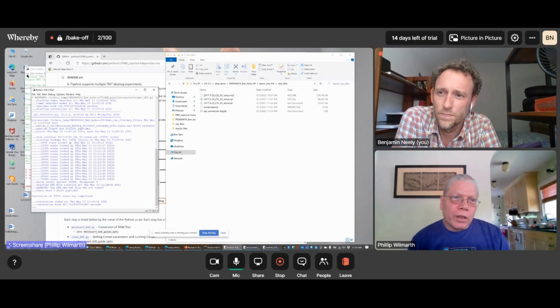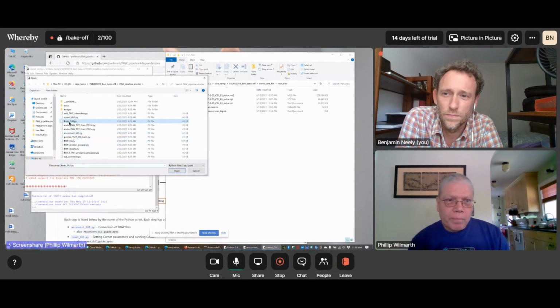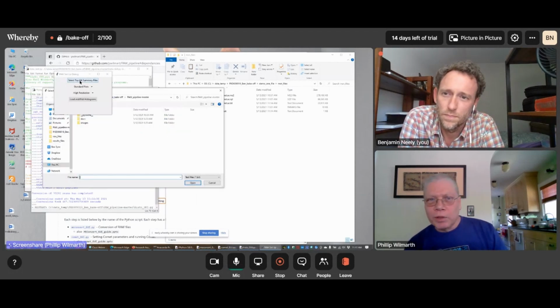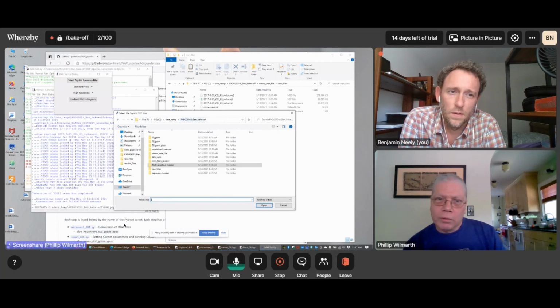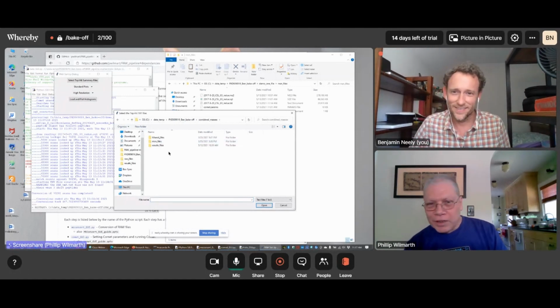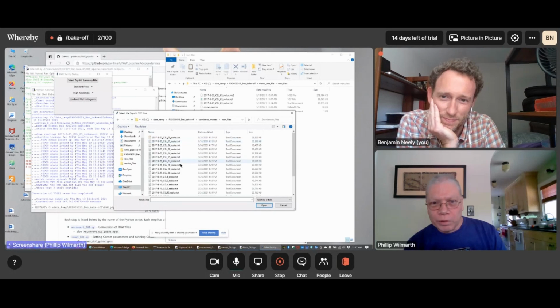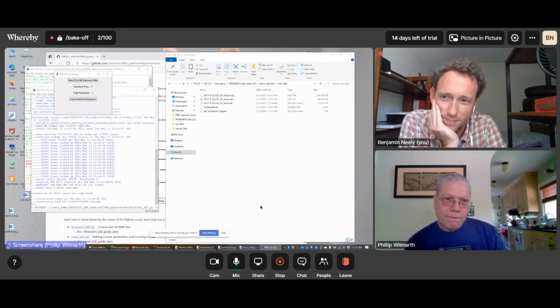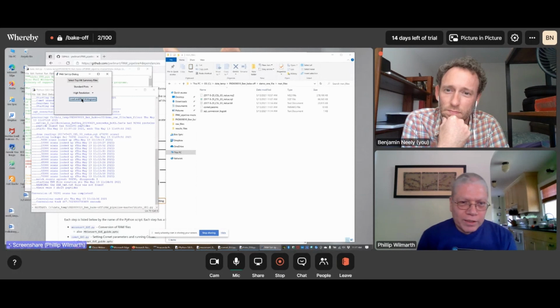So now we're ready to look at the histograms. And that's the histo GUI program. Run that. Now we have to select top hit summary files. And what we will do here is actually look at all of the data instead of just that single data. So here we've got results from all 19 raw files. What we have to do is select the top hit summary files that are in our MSN folder. Select those. Now the default settings here, you can change some things on that, but I never do. So now we just need to load and plot the histograms.